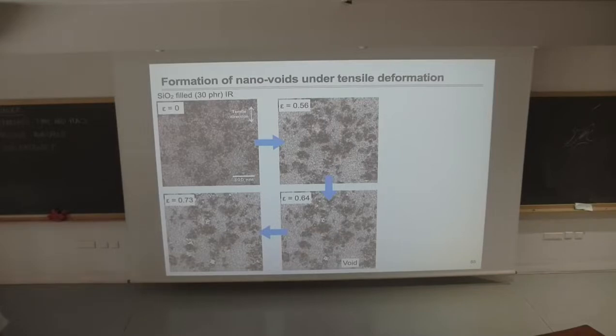Yes. And you need to dye, for example, dye some of the network. If you dye, meaning staining, then you had better not stain the sample. So you need to find a way to observe the sample in an unstained state, like some sort of contrast enhancement. Once you stain, then it's a different story, I think. Probably I imagine the stain can't go through the sample. Once you stress it, the unstained surface will be exposed. That could happen. Yeah.